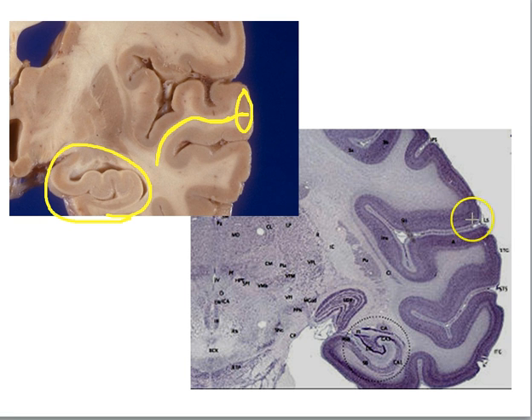We can see the same thing down here on this picture. Again, the hippocampus is right here, but here the cell bodies have been stained a purplish color. But you can now clearly see the outer surface of the cortex is where the cell bodies are. And all this material in here is white matter. So those would be the axons connecting brain cells with each other.